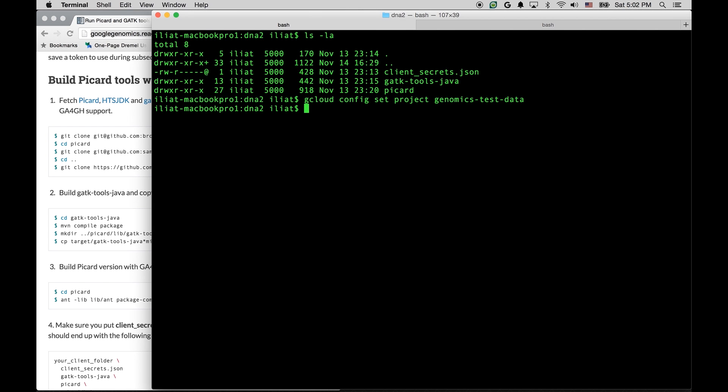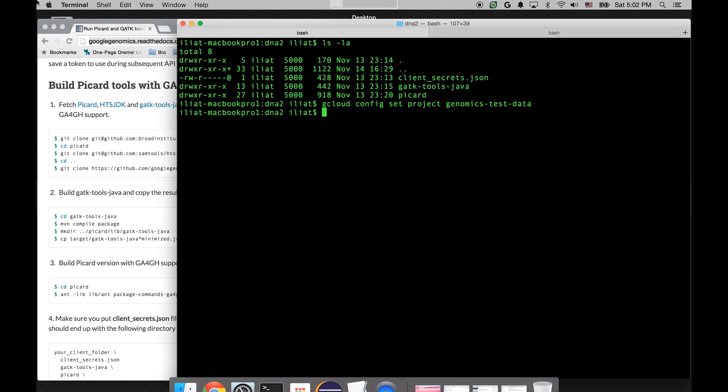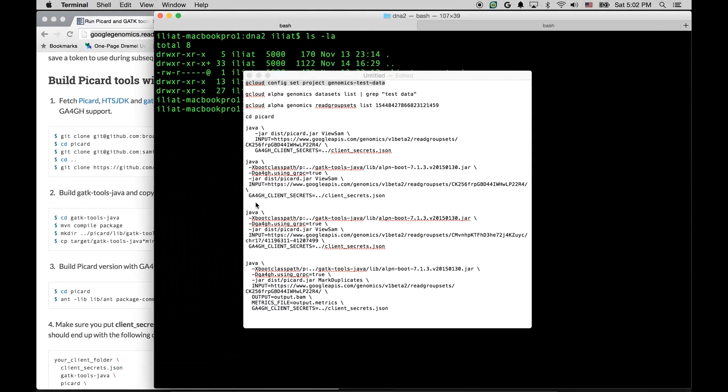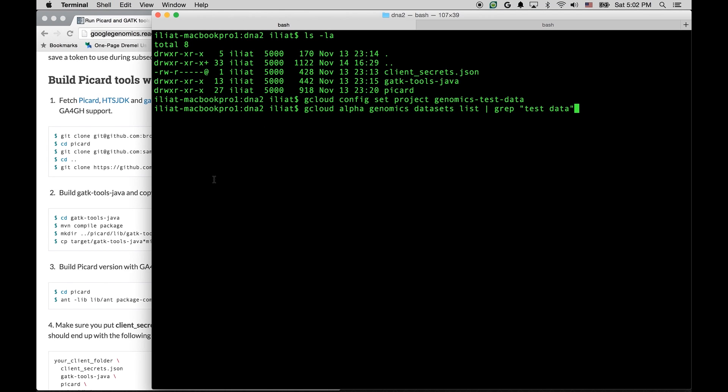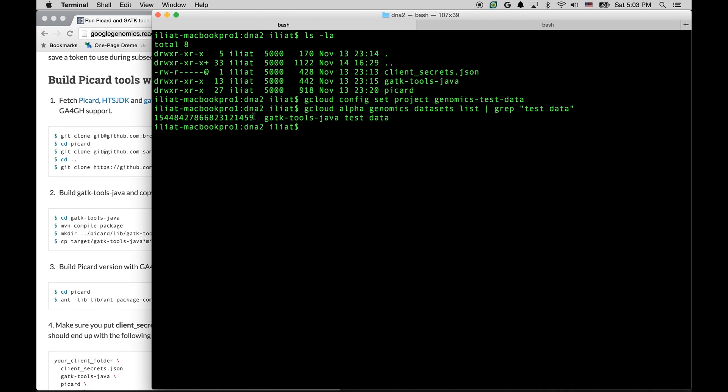Now, let's find the dataset that we are after. We're going to use GCloud tool again, this time to run Genomics API command to list the datasets to which we have access, and then find the dataset which is called Test Data. So we've done that, and we have the ID of our dataset.